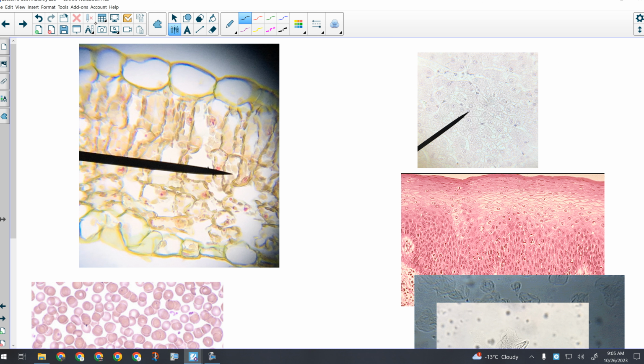What do you suppose those green ovals are? Chloroplasts. Those are chloroplasts. You can see a lot of detail in the plant cell because the plant cell is really big. I mean, for a cell, really big. So most of the structures are pretty obvious. So that's what you're going to be looking at for a plant cell.